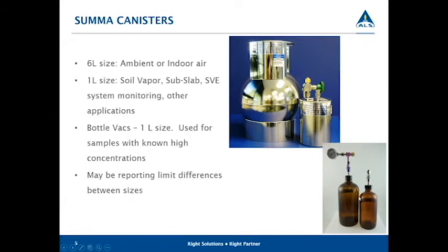So they would be a good option for testing a soil vapor extraction system, something like that, where you're expecting high VOCs. And that helps the lab out, so we don't have to do a really rigorous cleaning process to clean out the summa cans with percent level VOCs in them. There may be reporting limit differences between these sizes, something to note.